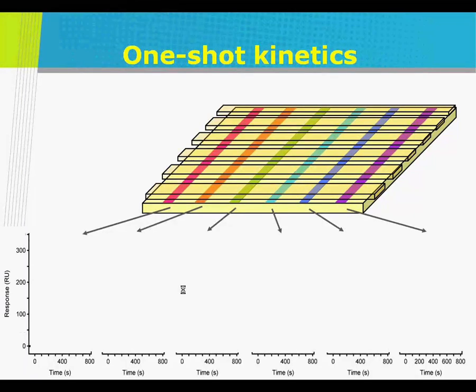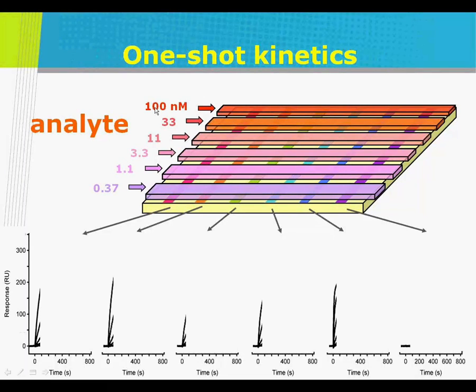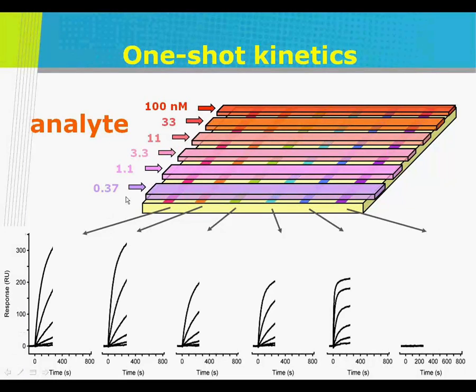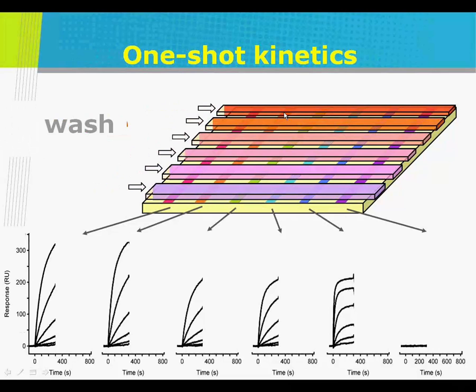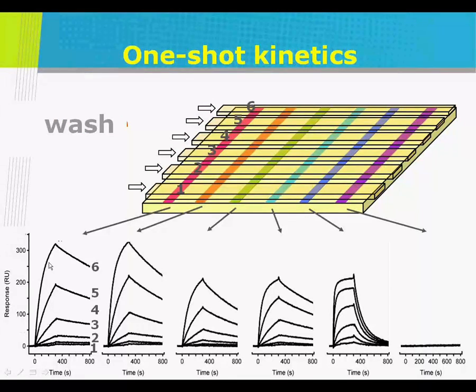So the beauty of the instrument is that you can analyze a lot of ligands and potentially analyze at the same time. You get this sort of one-shot kinetic concept where you can inject up to 6 different concentrations in this case, and potentially no regeneration is required.